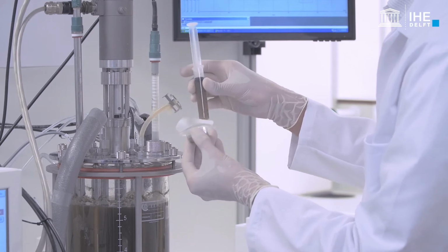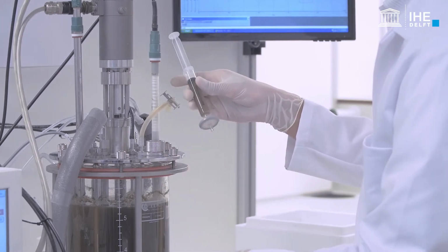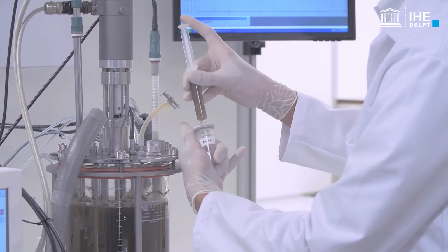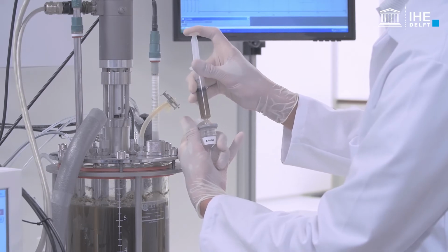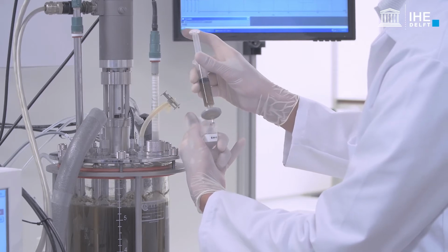For the determination of the soluble compounds of interest, filter the samples through 0.45 micrometer pore size filters. Do not apply excessive pressure, thus avoiding that the filters break.